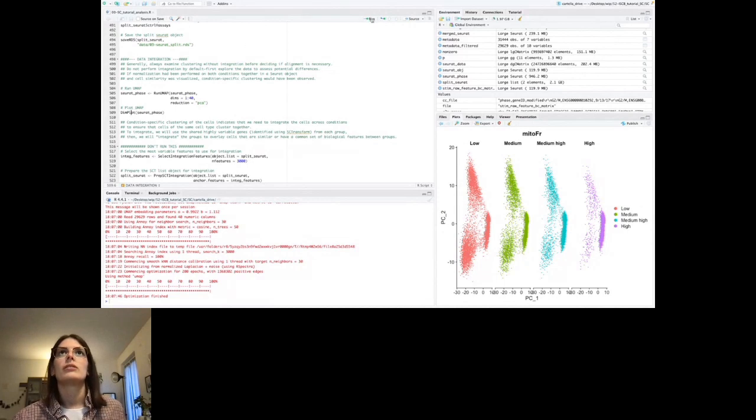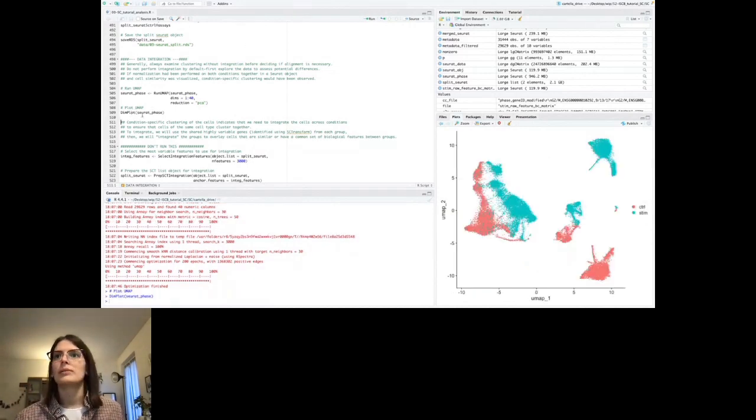So then with the DimPlot function, we actually plot the UMAP, and here it is. The UMAP is a bit complicated, but it can help to think of the dimensions as if they were principal components, okay? It helps your reasoning if you put it like this, but they are actually a bit different mathematically speaking. But here, what is the meaning of this? Each dot represents a cell, and cells that are close to each other are very similar from a transcriptomic point of view, okay? Here I colored the control in pink and the stimulated sample in blue.